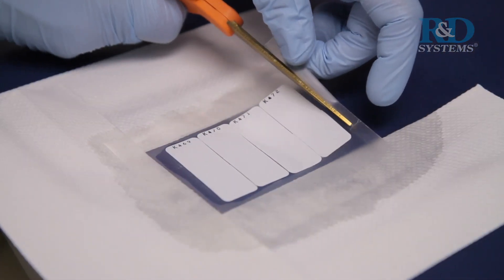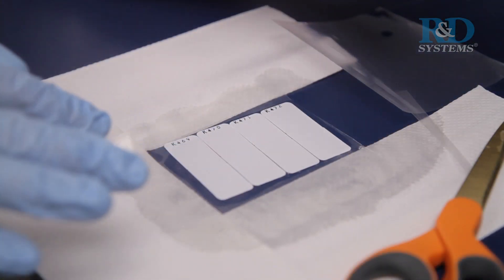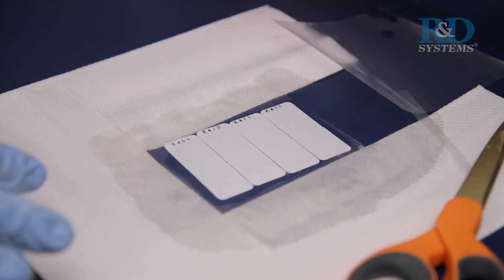Remove the top plastic sheet protector and carefully lay an absorbent lab wipe on top of the membranes to blot off any remaining chemireagent mix.